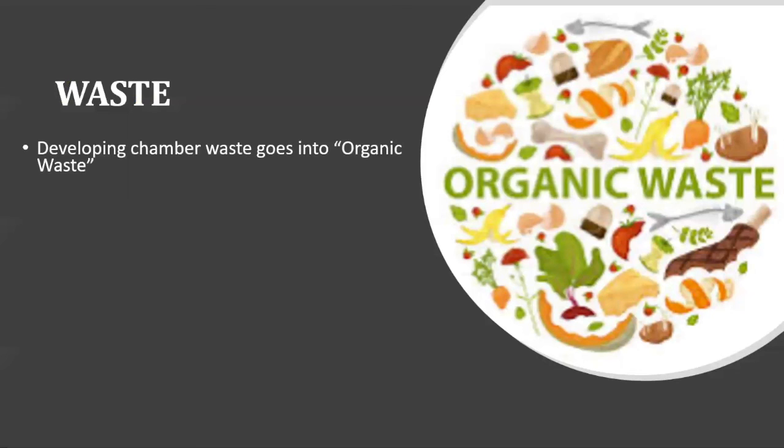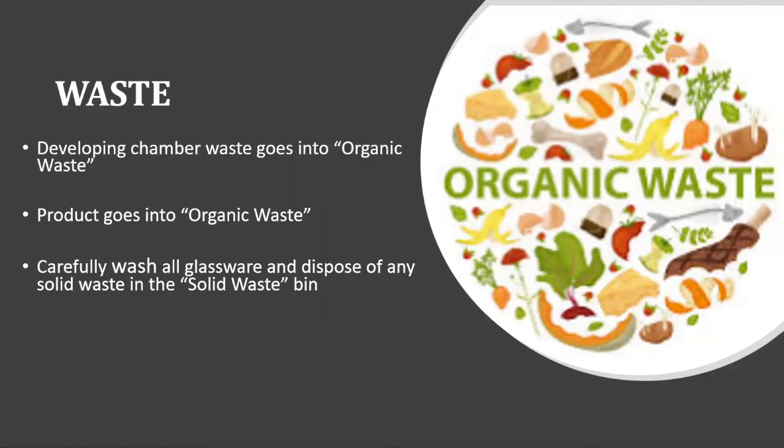To clean up after the lab, the developing chamber waste will go into the organic waste. The product will also go into the organic waste. Carefully wash all glassware and dispose of any solid waste in the solid waste bin, such as TLC plates. And all acid waste will go into the aqueous waste.